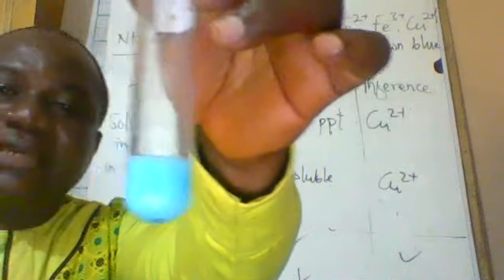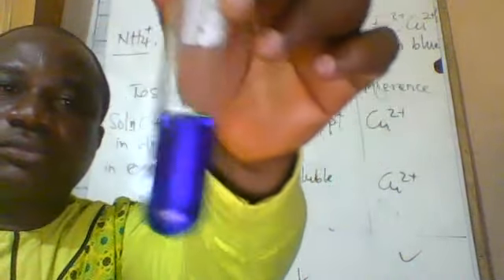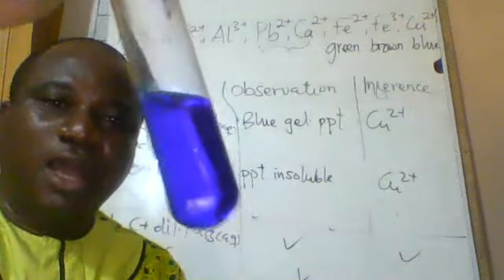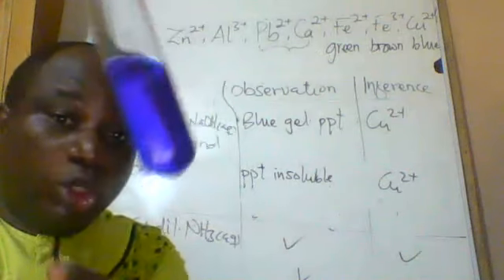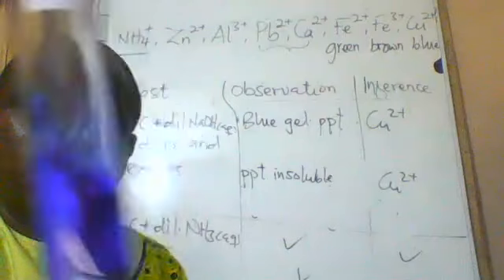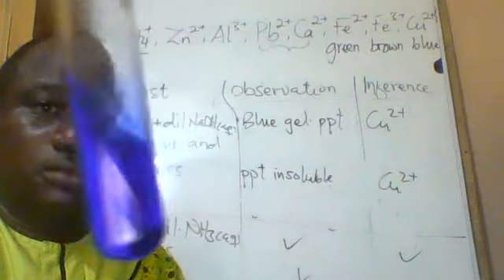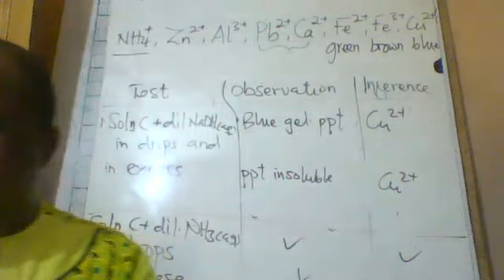But when you add the ammonia in excess, the PPT dissolves, forming a deep blue solution. Just very clear deep blue solution. Have you seen it? Yes.